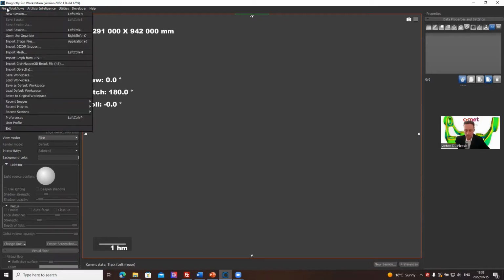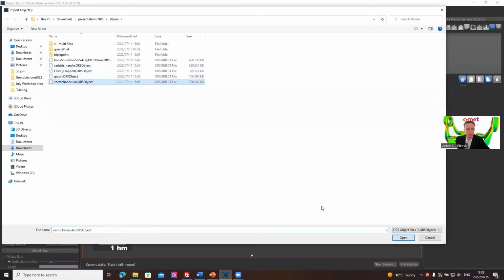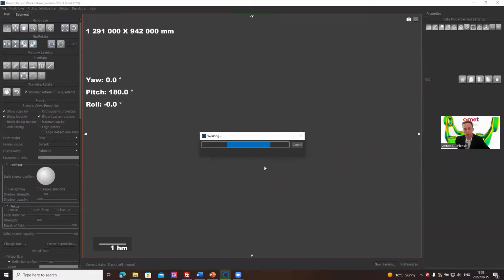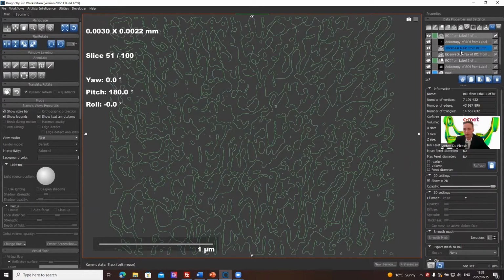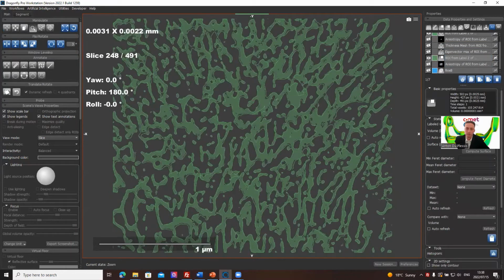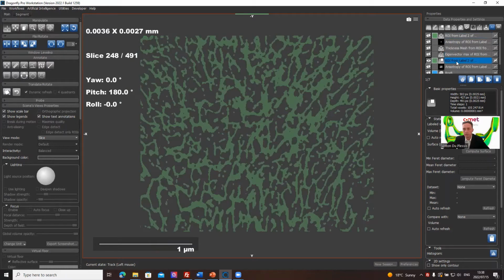depth here. So let me first load up, import an object, which I've got already computed vector fields on, human trabecular bone. So I've got this data for actually a region of interest, which was segmented from the femur of some bone. And we've got a mesh representation of that, the green line. We just need the region of interest for that.